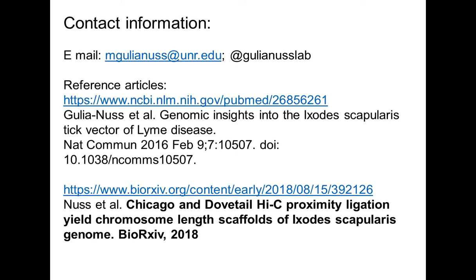Another really good feature of a chromosome-level assembly is we will be able to now make more physical mapping, per se. I'm using it a little loosely, but we will be able to see how the genes are arranged on the chromosomes and which genes make a group. So the synteny will be improved quite a bit, I'm hoping.